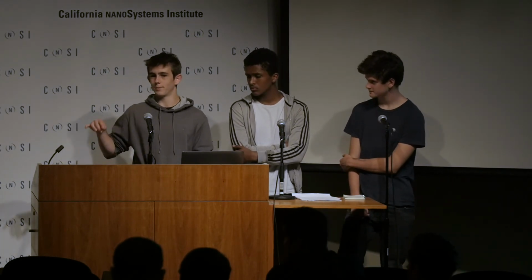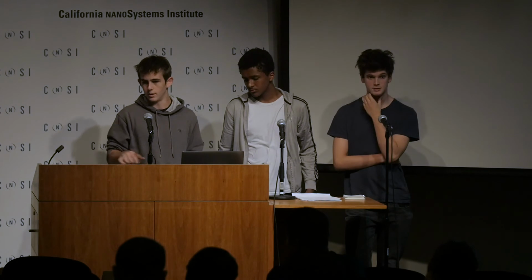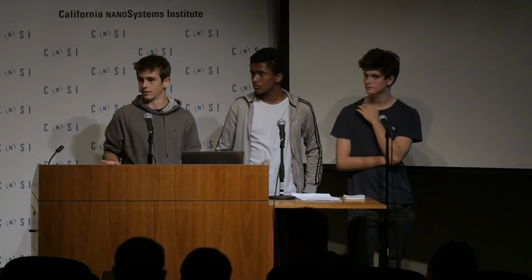Was that the microscope that, instead of using light or electrons, used a probe that's only one atom thick at the very tip of it? So it's able to run over the surface like a person reading Braille. When it runs over it with that probe, it's able to feel the bumps and therefore create a really fine image. And you can also code it to sense magnetism or charge, which could be helpful because the heads are polar and the tails are nonpolar.